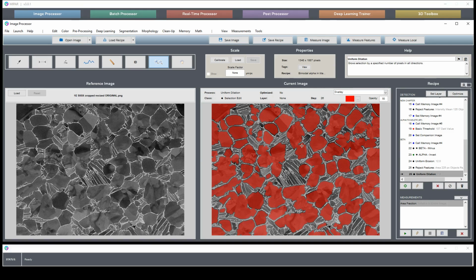Remember several lessons ago, I talked about what distinguishes a feature versus what defines a feature. And here we have these markers which distinguish primary alpha from secondary. And then we'll go back to our original and get a different segmentation which defines the edges of this secondary.